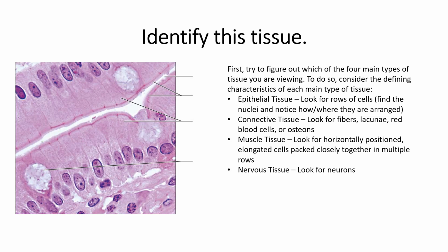We don't see that here, right? Even though you may be saying, well, there are 2 rows, but these rows are separate from each other, right? Because we have the lumen here. When we're talking about multiple rows, we would be saying like the row that you see here, and then underneath it a row, and then underneath that a row. We don't see that here.